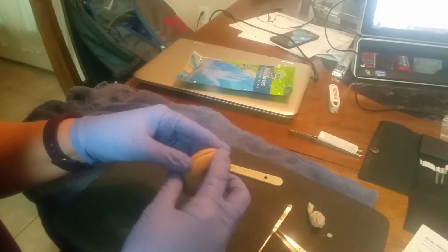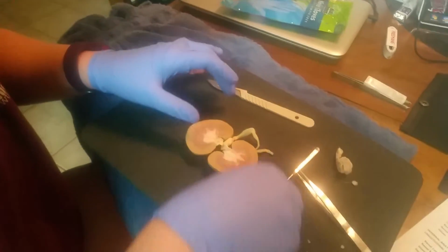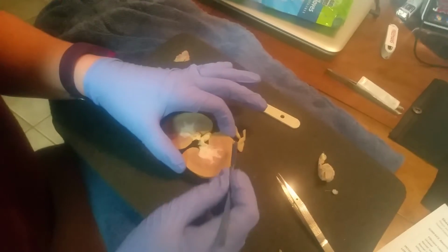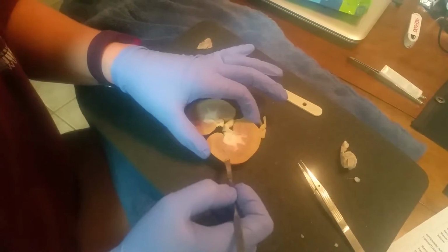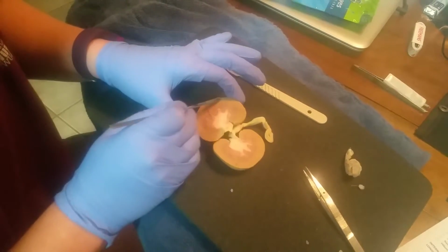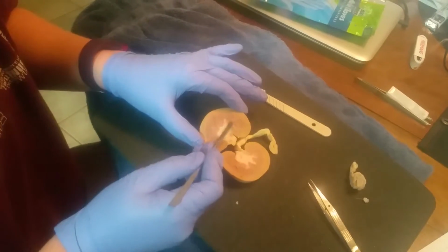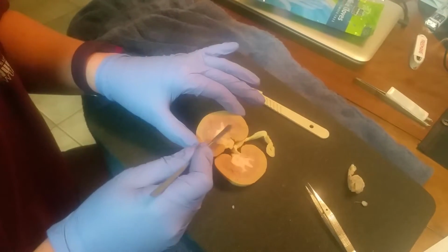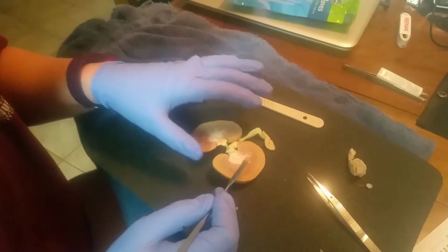And then moving on inside the kidney, we open it up. We have this lighter area right here, which is our renal cortex, right here and right here. And then moving on into these darker spots on this side as well is our renal medulla.